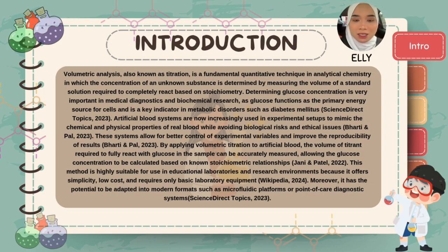Analysis, also known as a titration. It is a fundamental quantitative technique in analytical chemistry in which the concentration of an unknown substance is determined by measuring the volume of standard solution required to completely react, based on stoichiometry.